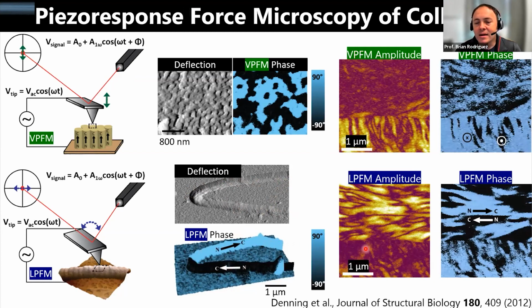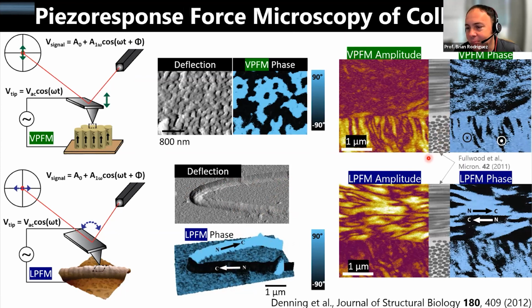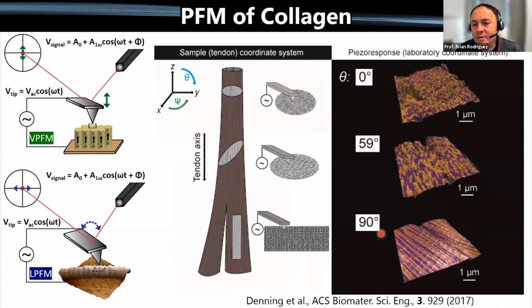and cornea has a very interesting structure with orthogonal lamella of very small and regularly sized collagen fibrils, and we can find with AFM this location, and it matches quite nicely what we might see with a TEM image of the cornea. So we can see that the fibrils in this location are oriented horizontal in the screen, and the fibrils in this location are sticking out of the screen. So we get a high response in the amplitude in this orientation and a high response in the lateral in-plane signal in this orientation.